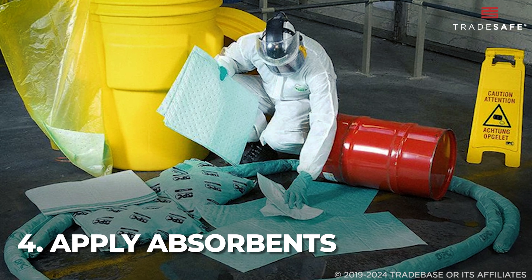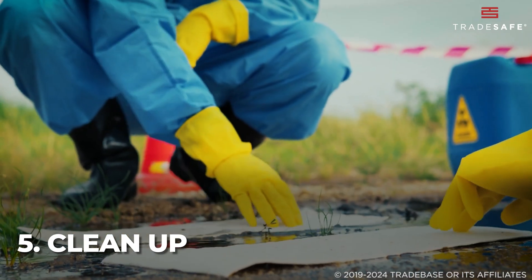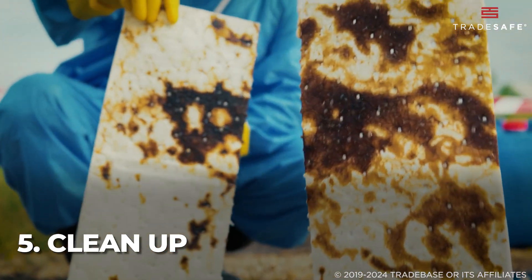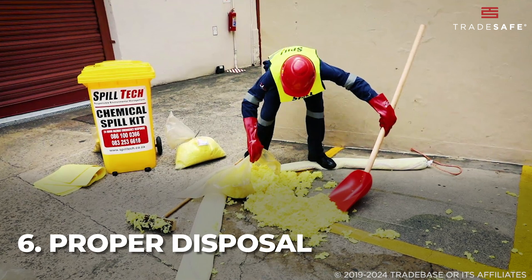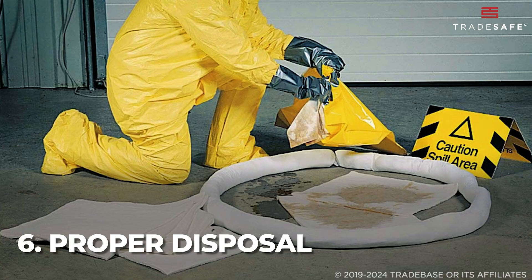For uneven surfaces, use granular absorbents. Carefully remove saturated materials and replace with fresh absorbents until the spill is fully contained. Proper disposal is important — seal used materials in the provided bags, following labeling guidelines.